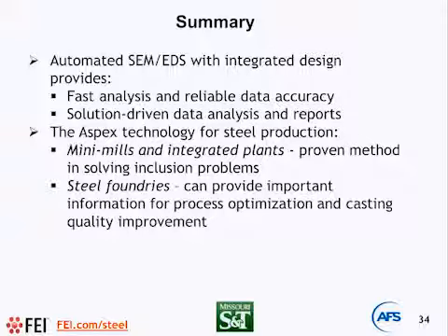We remove particles visible less than 4 microns typically, and we consider only large particles. But small particles are crucially important. In some inoculation techniques, we develop small graphite particles at the last moment of solidification, and these particles significantly affect pearlite and ferrite formation. So by ignoring this information, we completely lose the most important information.